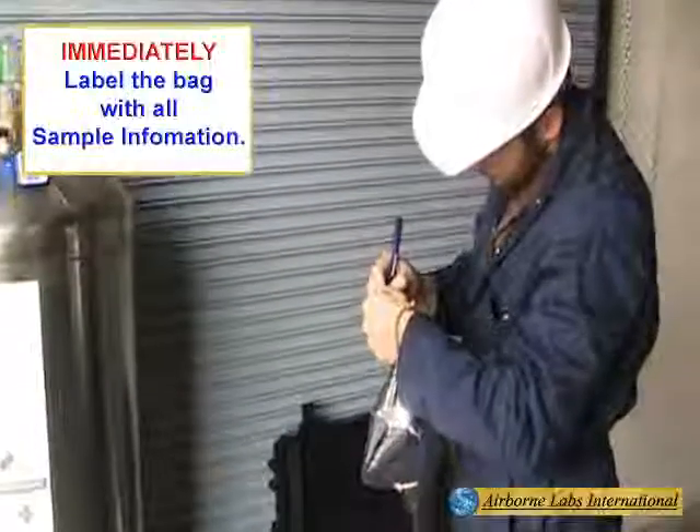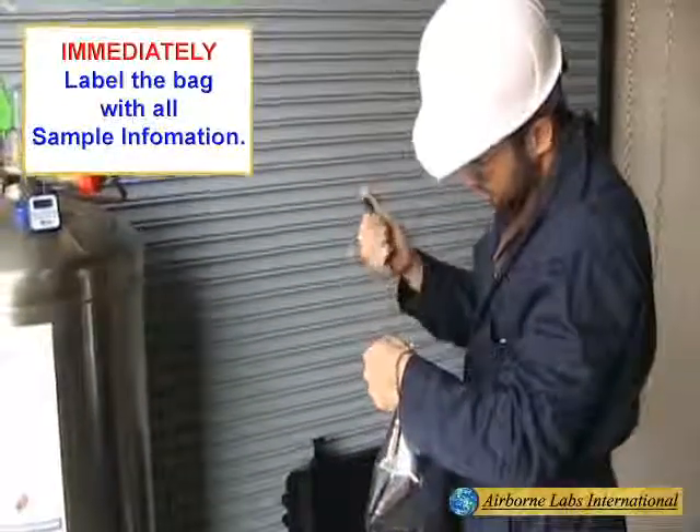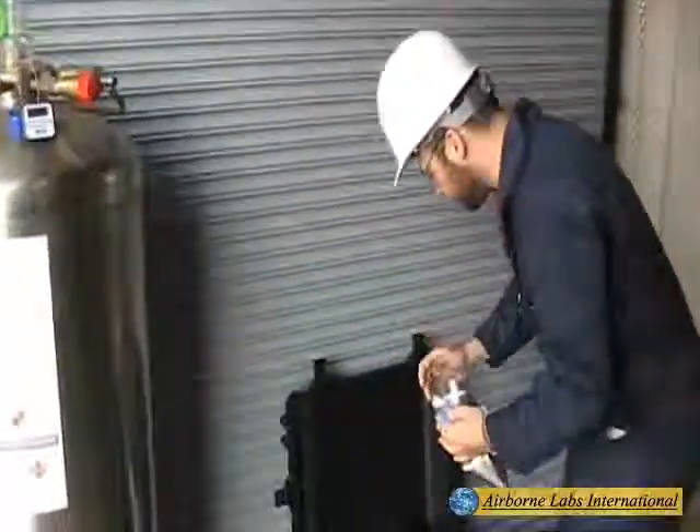Immediately label the MLB with all sample identification information, then replace the PTFE port cap.